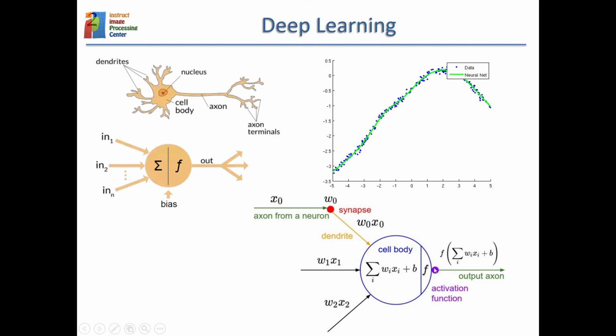But then these biological models grew up into a complete domain of their own. They have this origin, but now these kinds of functions make sense by themselves in machine learning computation, and actually they can be regarded as a regression model.